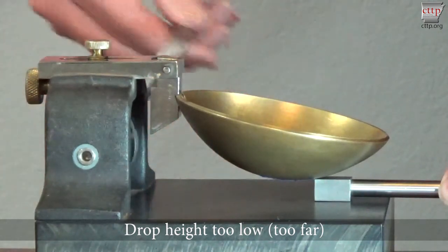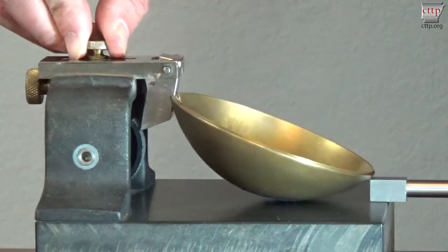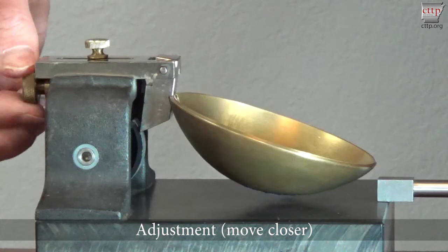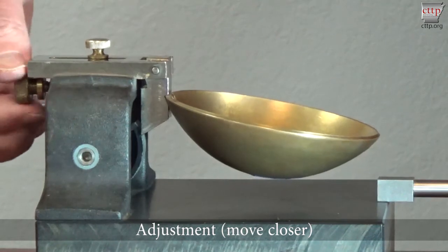Hold the gauge block so that it lies flat on the base and turn the crank. Watch the cup for movement. If no contact is made between the hanger arm and cam, the drop height is set too low and must be adjusted. To adjust it, loosen the set screw on top of the machine and turn the adjustment screw on the rear of the machine to move the cup closer to the cam. Then tighten the set screw.